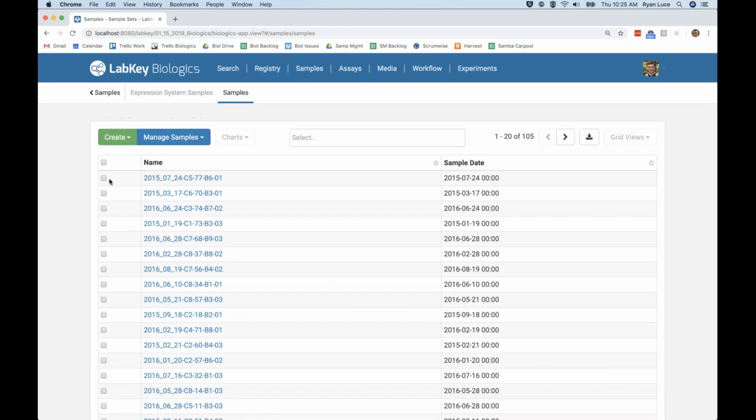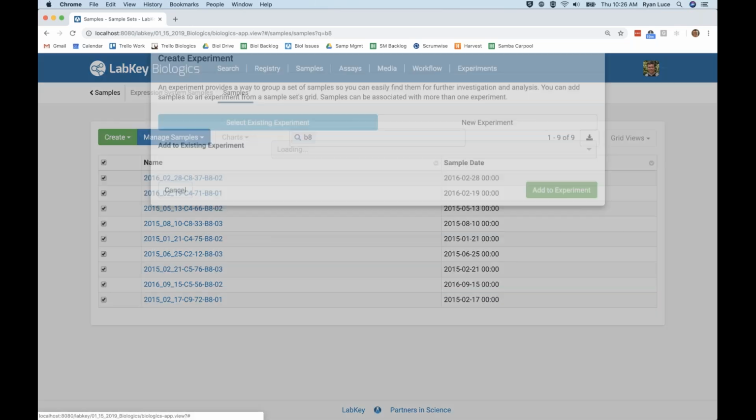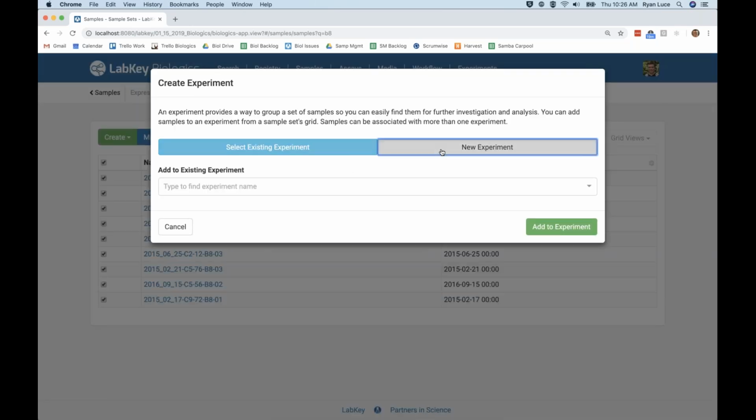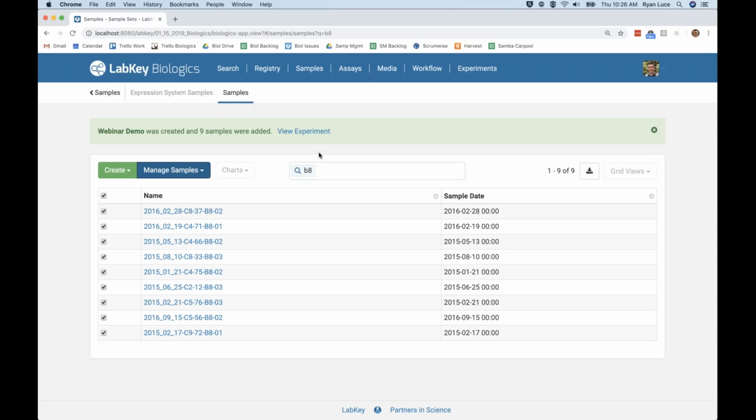So for instance, if I've just generated a couple of samples, let's do some sort of a selection of these. Let's say we're just looking for those particular samples. I'm going to select them all, and I'm going to add those to an experiment. This is going to be a new experiment. We'll call this webinar demo. And it's just as easy as that. So we've created a particular experiment.